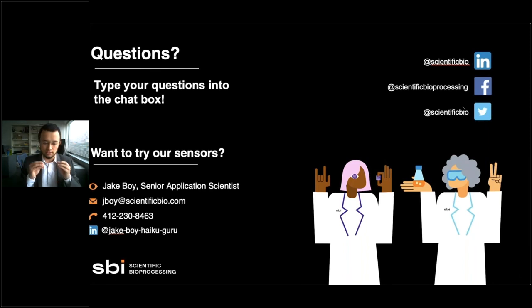And that way they could modulate where the microspheres were inside the spheroid, right? If I have three spheroids, and I know that in this spheroid the microspheres are at the surface, in this one they're closer to the middle of the radius, and in this one they're at the very core, then I can just measure oxygen in each one of them separately and try to obtain a profile through the cross-section of the spheroid. That's another possible strategy for doing that.